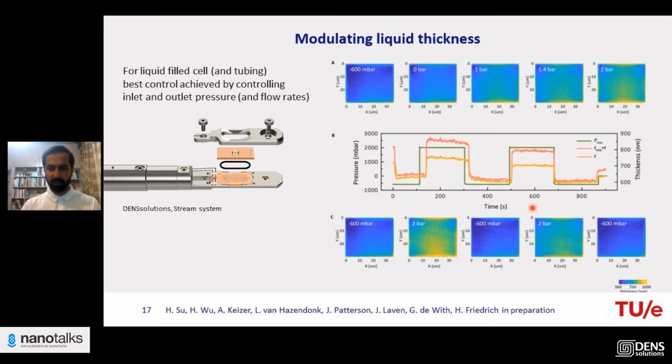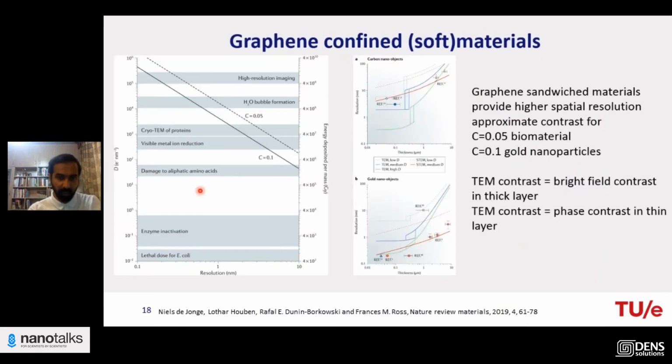Due to the reaction you're doing, whether you want to do that in bulk and let the reaction go, and then you want to increase your resolution, then you can actually get a little bit higher resolution. You can work with this. So you can see here the domain of this increase and decrease is about 300 nanometers.